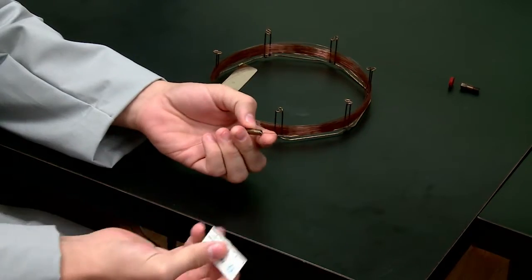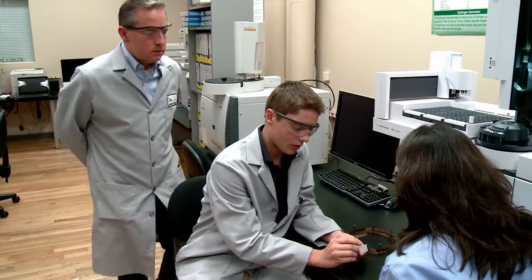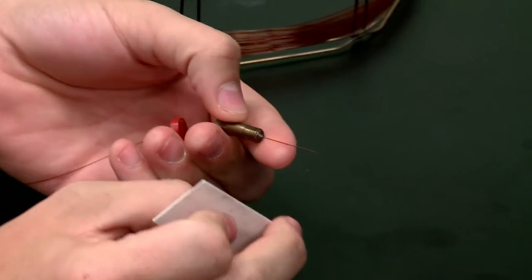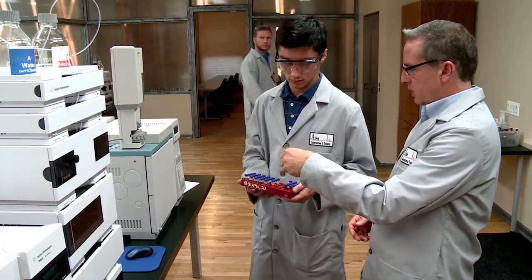So one of the things we've noticed in our business, since we're in the business of training the operators to run the GC, is that the experience level, the education level of the average user has dropped quite a bit over the last couple of decades. I don't see that as a bad thing. In fact, I see that as a good thing. I think we should be able to make the GC easy enough to use that the person using it should not have to be a chromatographer. You know, to drive a car, you don't have to be an automobile mechanic, and you shouldn't have to be. So I think that's where we're getting with the GC.